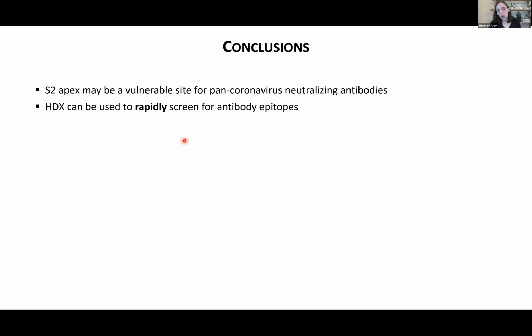Okay. So the next application I want to talk about involves looking at a protein interaction with nucleic acid, specifically with RNA. This is work again by a PhD student in my lab called Naifu Zhang. The protein of interest here is MTR4. MTR4 is an essential ATP-dependent RNA helicase. It's highly conserved. We're working with the yeast protein, and it's absolutely required for all activity of the nuclear exosome. In other words, it takes RNA and unwinds it, feeding it to the exosome for degradation.